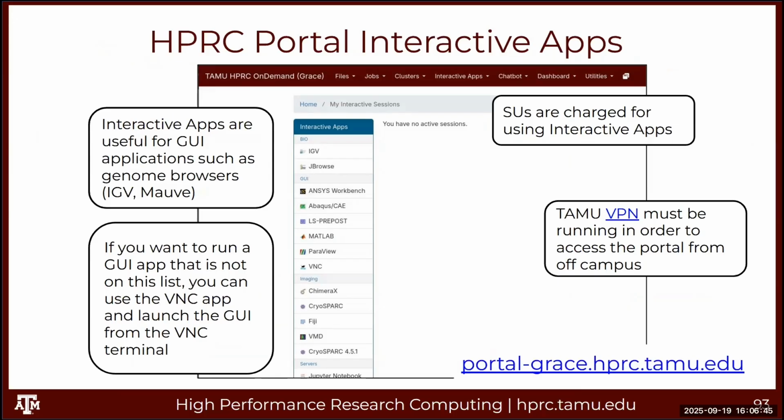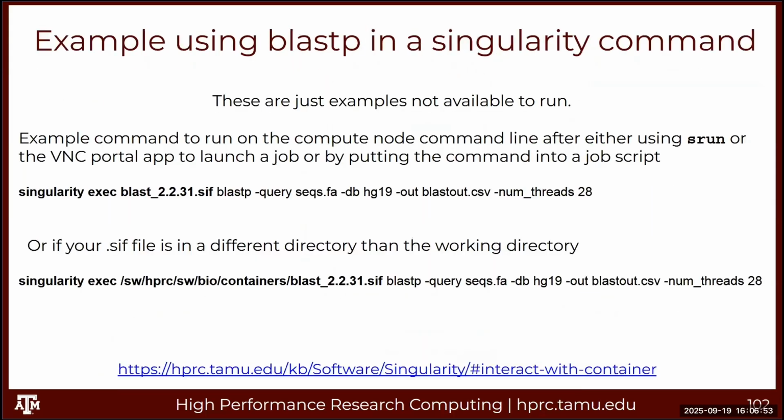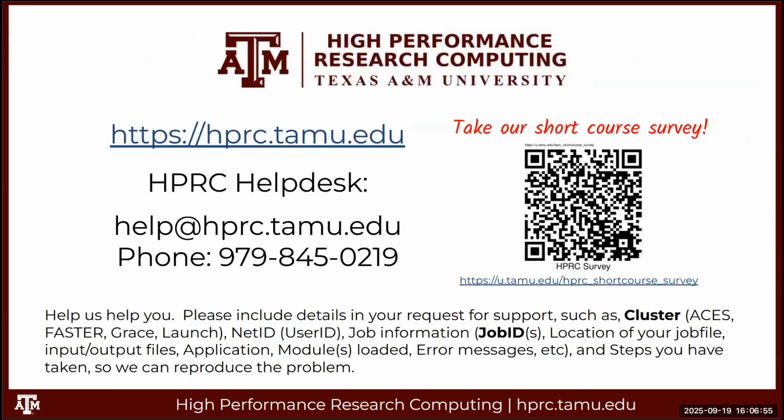Portal apps, we kind of went over that. We would have gone through JBrowse, but we're out of time. And you can read about biocontainers if you need to. You can create one, but chances are we can create it for you, or we already have it, or you don't really need it because a lot of the bio software we have is installed or can be installed.